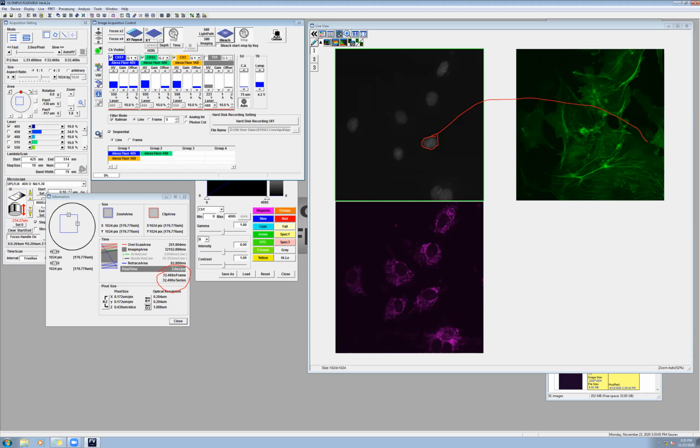If your goal is to look at co-localization of something, I would always recommend that you turn on the sequential scan so that just in case there is ever crosstalk between two channels, you don't misinterpret that as co-localization and actual signal. Is it always safer to have the sequential on? I know that it increases the time.